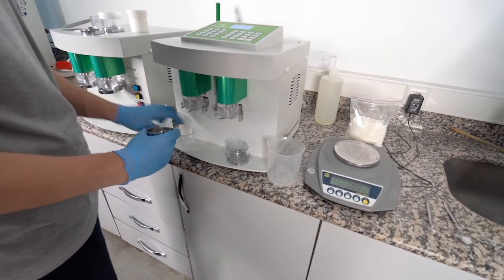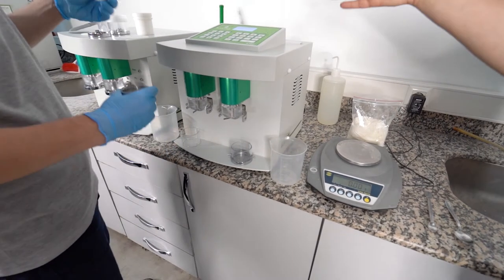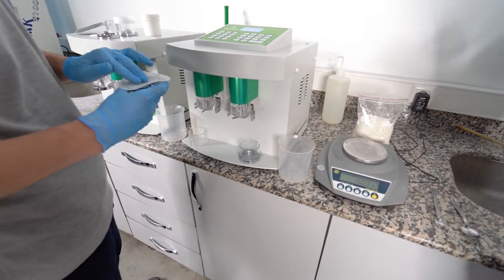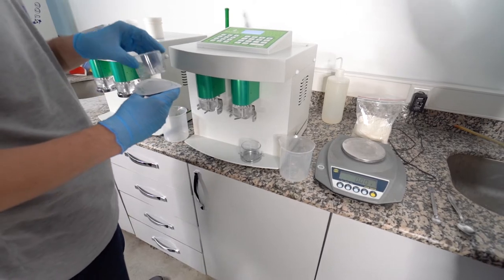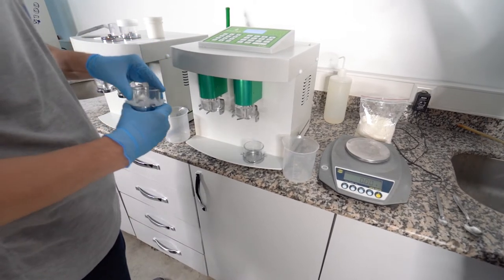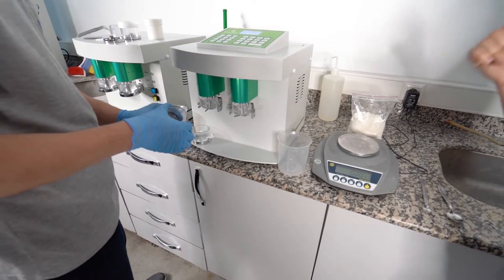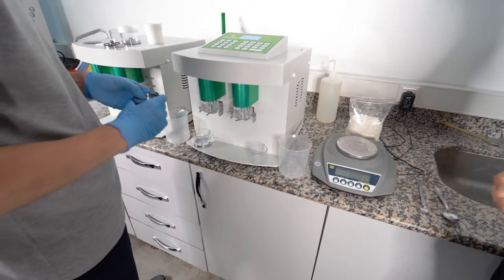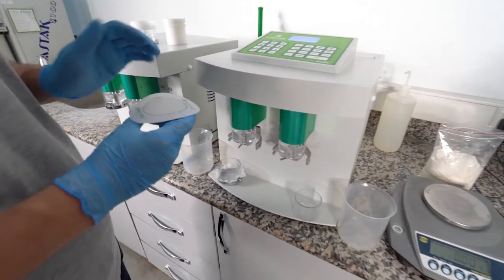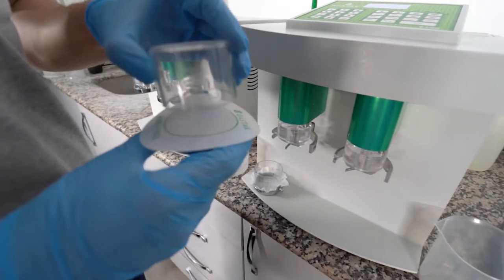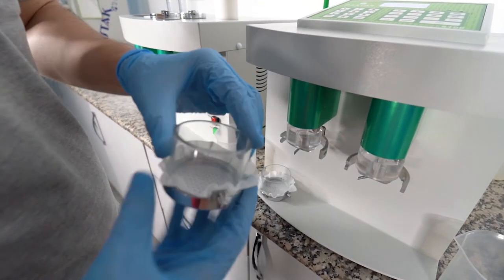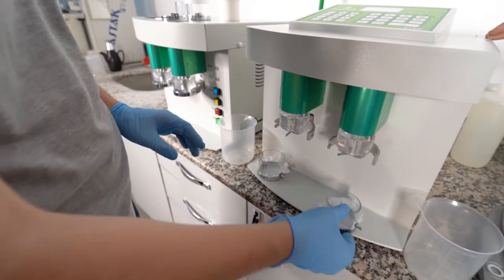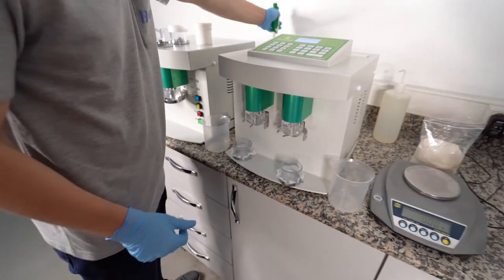While we are doing the test, I will introduce the functions of our buttons. We have differences between the basic model and the 6100 model, which has 27 function buttons. You can give ID, right ID, and left ID. If you are using different samples, including the printer, you can take out prints.